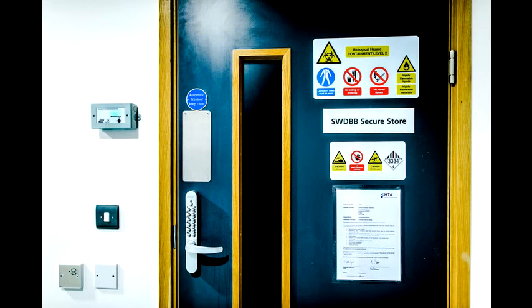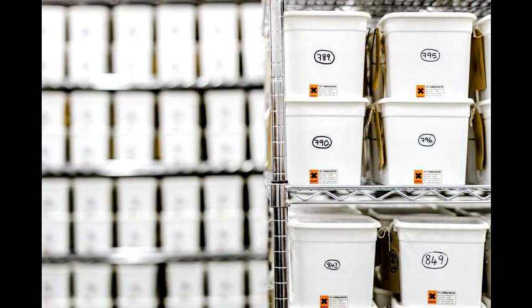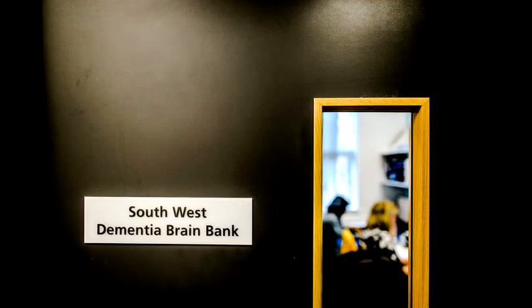This is our formalin-fixed brain store. At the moment we have one thousand and two donated brains within our bank. Once we've taken the areas and blocked those we need for diagnosis, the remaining tissue is stored in these buckets in formalin and is here for us to use going forward. If those blocks run out, there may be areas we can replace them with. We may also need different areas for different types of research, so storing this tissue here allows us to come back to it for years to come.